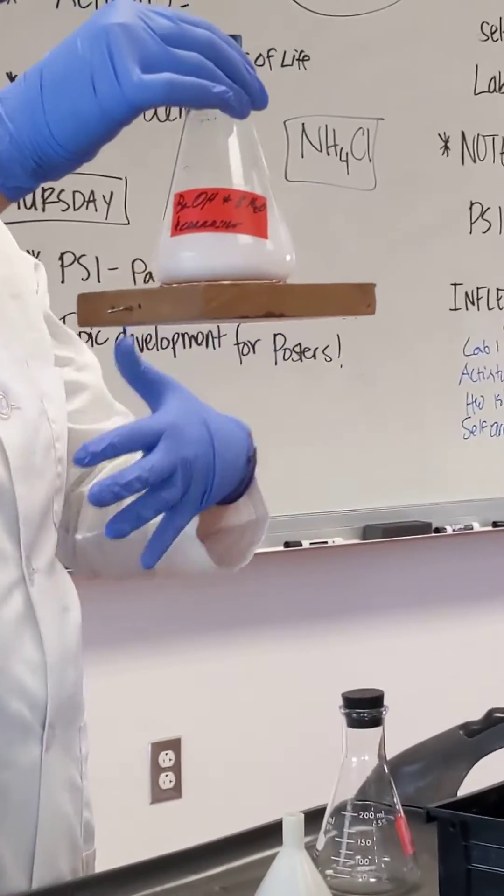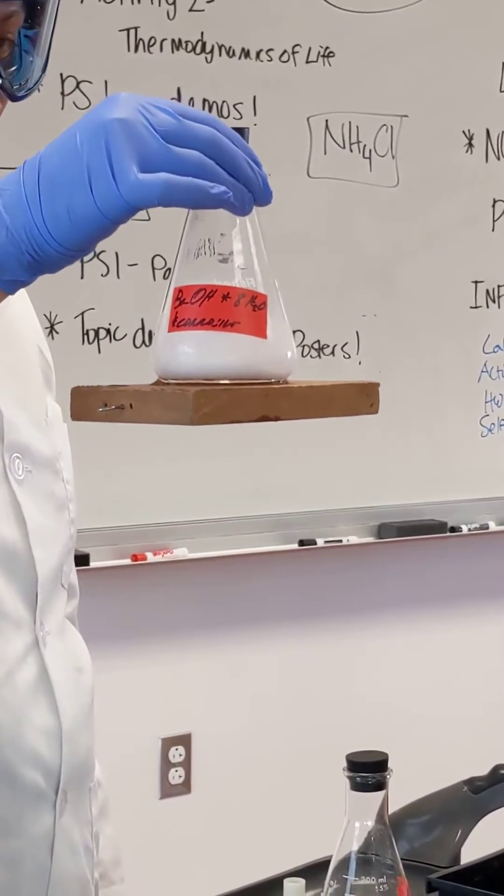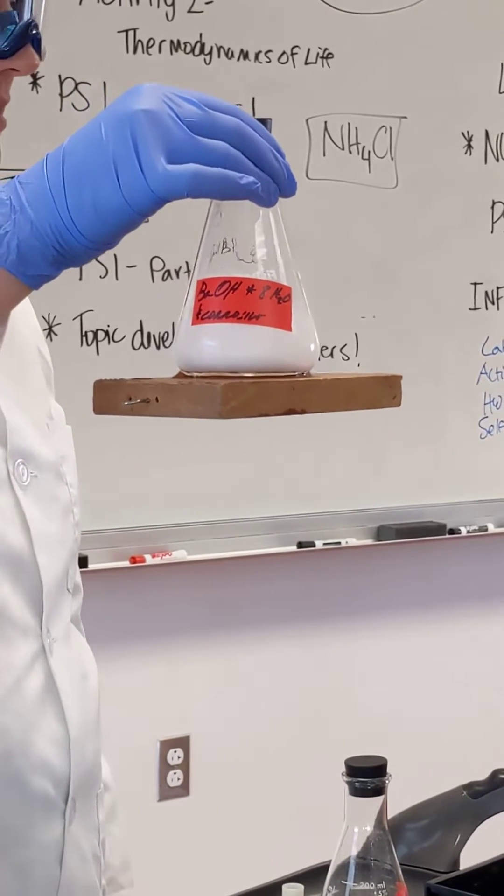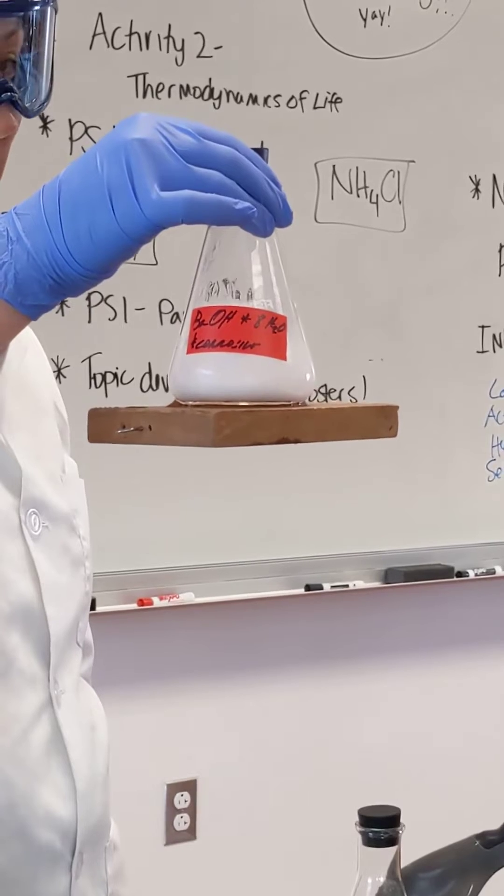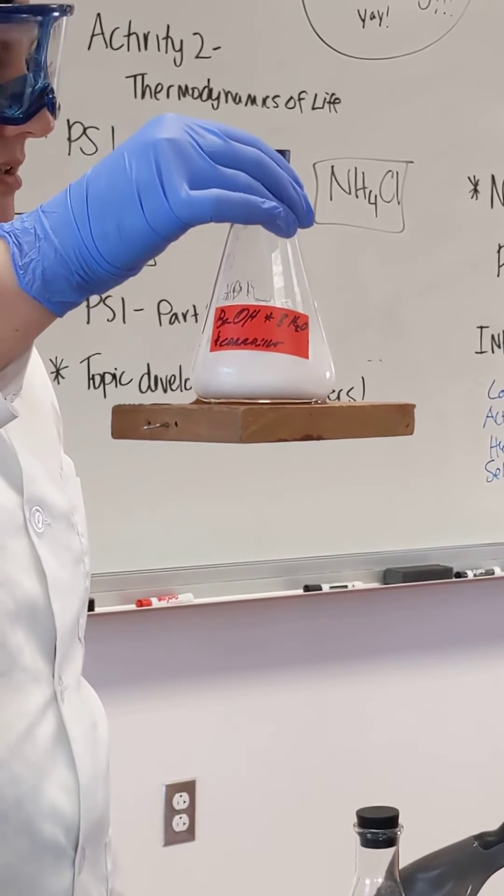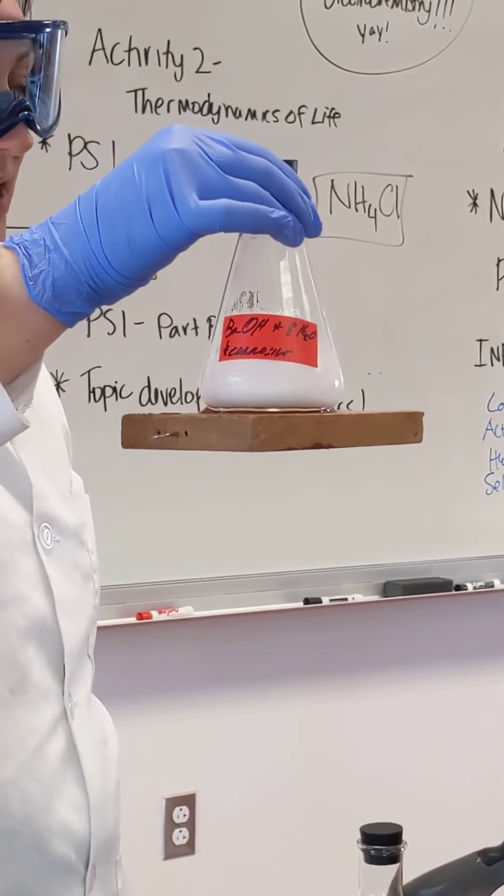So what's happening here is this solution has frozen the puddle of water that the flask was placed in as those solids combined. We froze the water, and now the wood is stuck to the beaker.